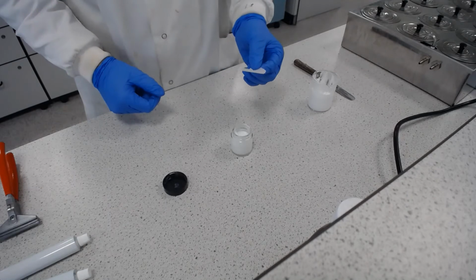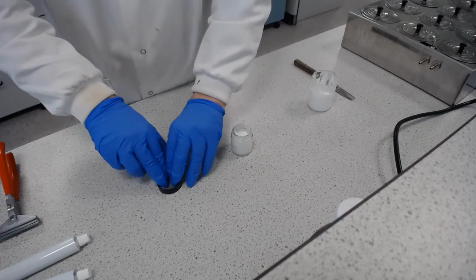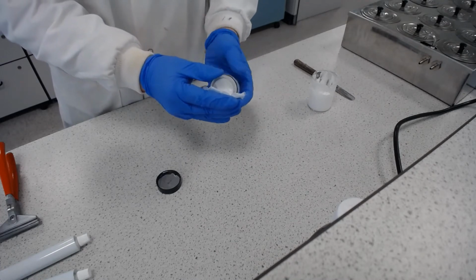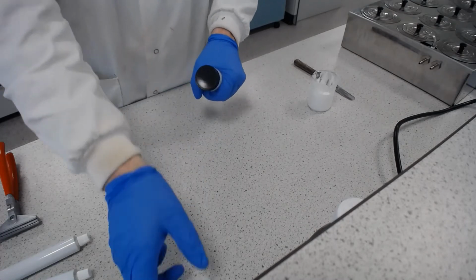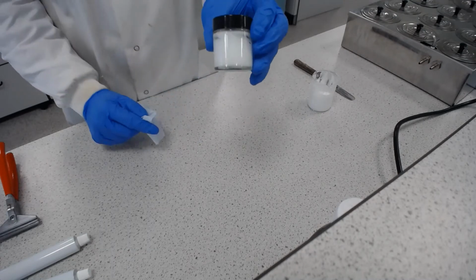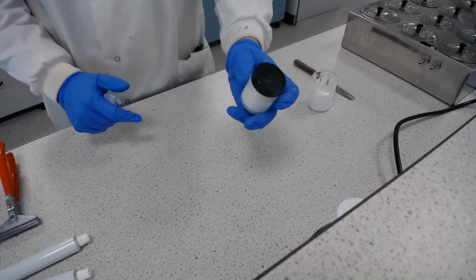One thing you'll want to do as well is take a circle of greaseproof paper and pop that in the lid. So that'll stop any of the cream going into the lid, and you don't know what's been in that lid before perhaps as well. You might also, just to finish it off nicely, want to take a bit of paper towel and just before we put the lid on, clean around the rim, then put the lid on, and then with another fresh bit of paper towel just clean up the sides for any that we've got around there. Alright, and then you'll get left with a nice clear, elegant looking pot of cream, of antiseptic cream in this case. So that's one way of doing it and putting it into a pot, probably the easiest way.